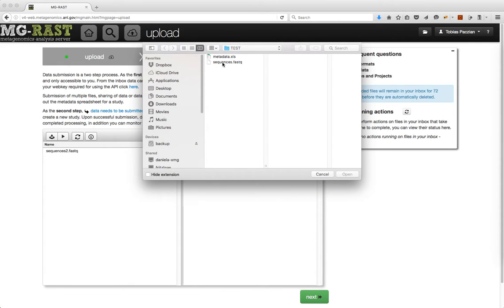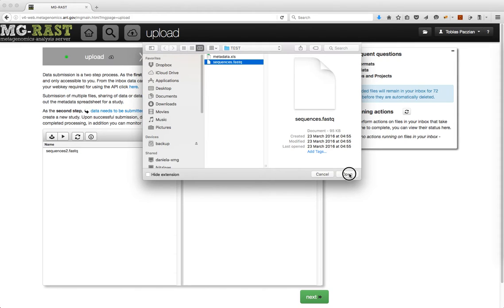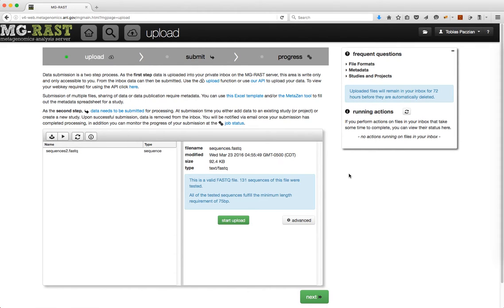First, I will select a sequence file to upload. Note that when you select a file, some basic tests are run to make sure it is in the correct format for processing. This is done automatically before the upload starts.